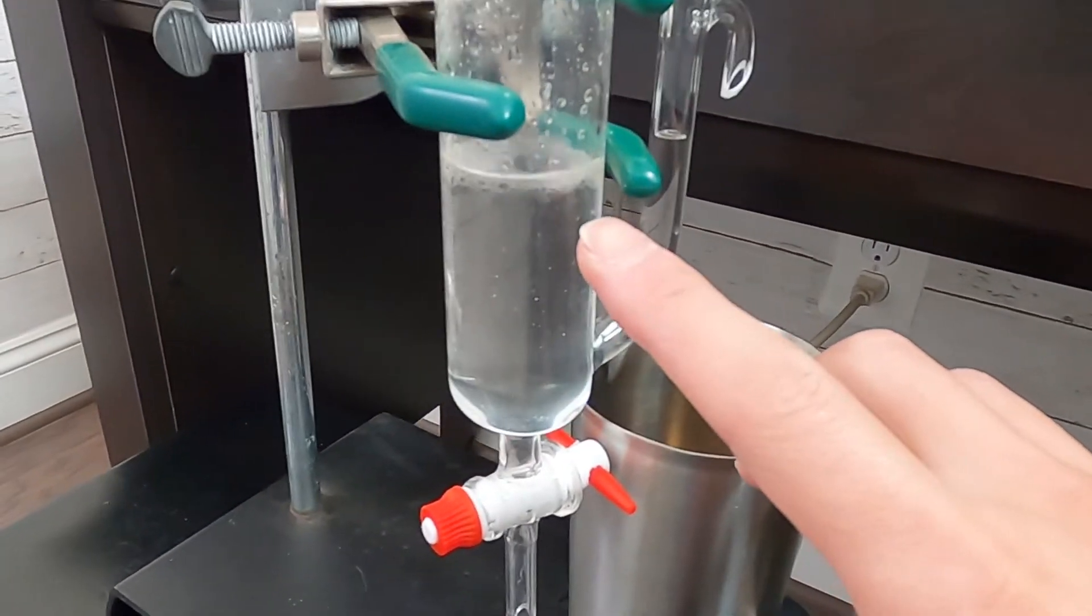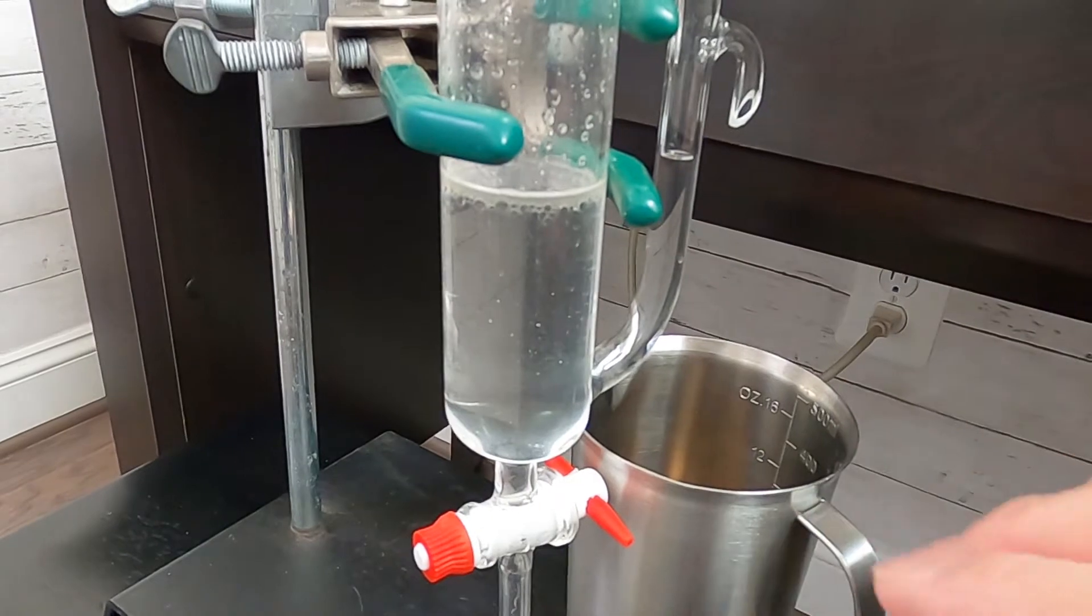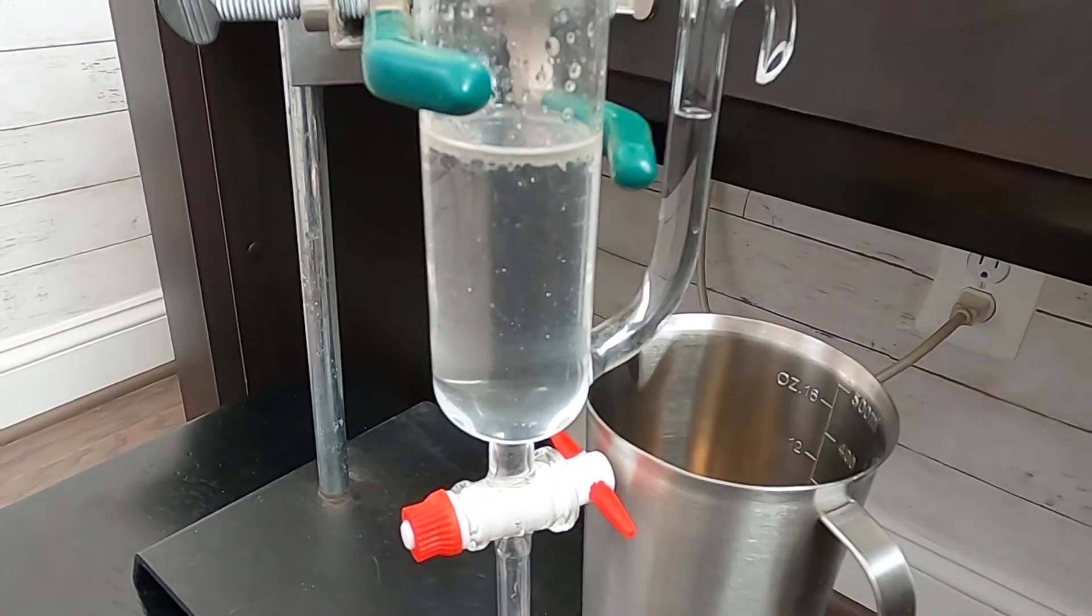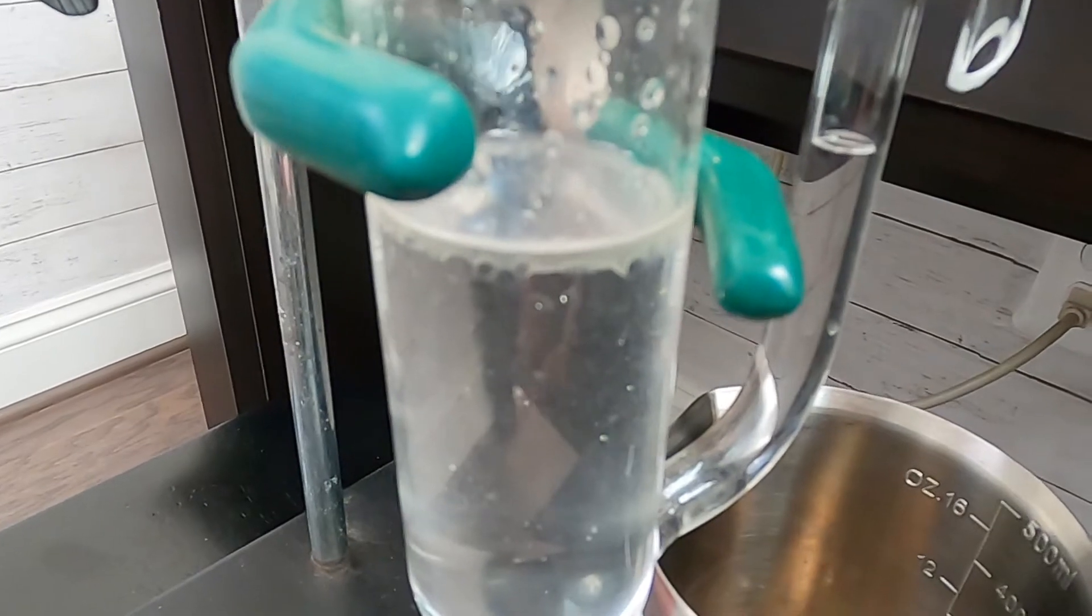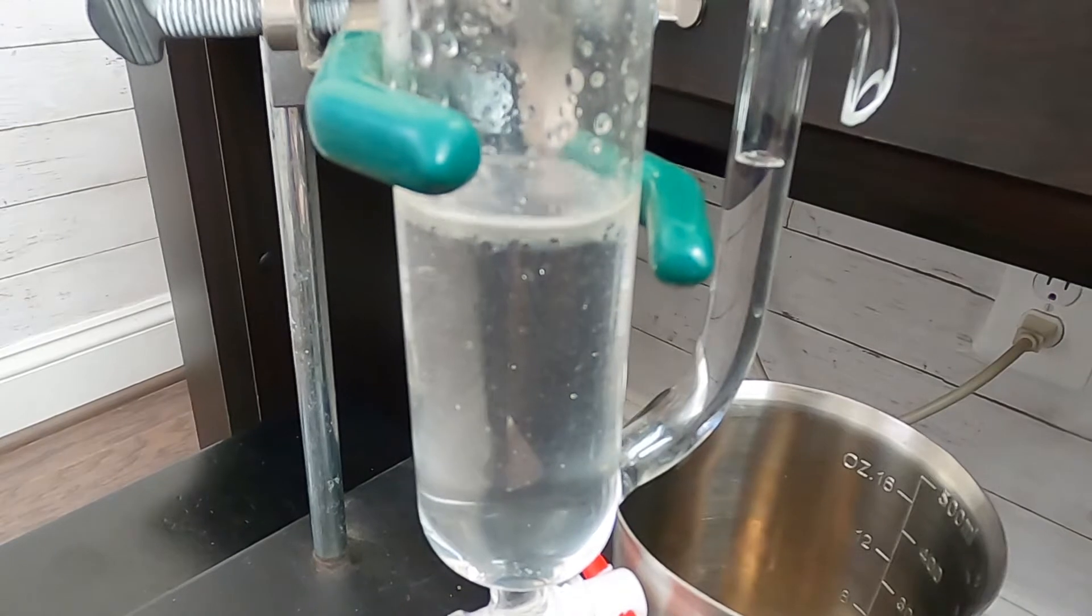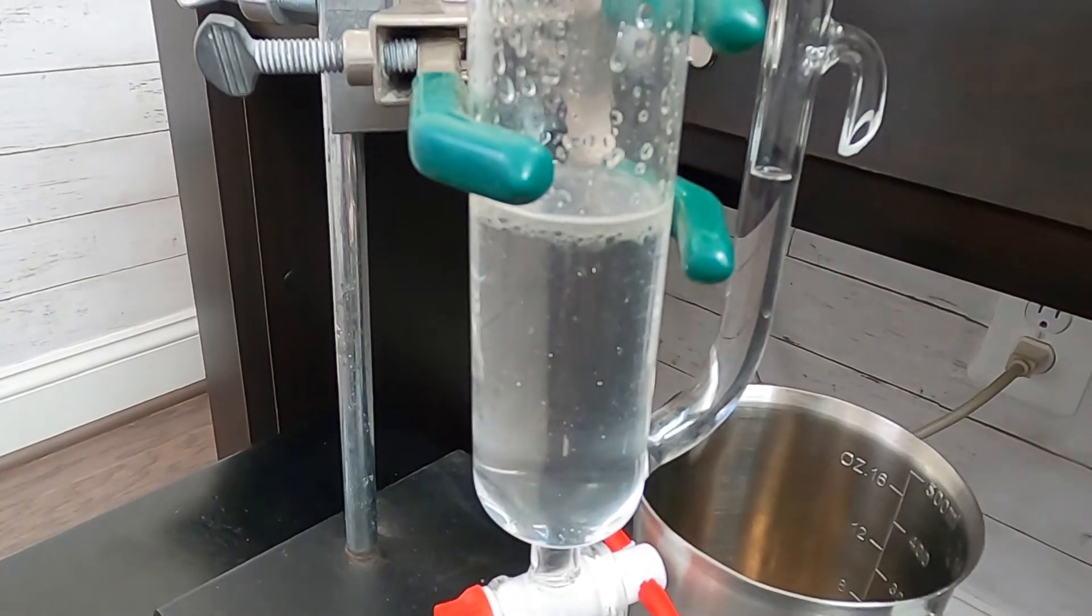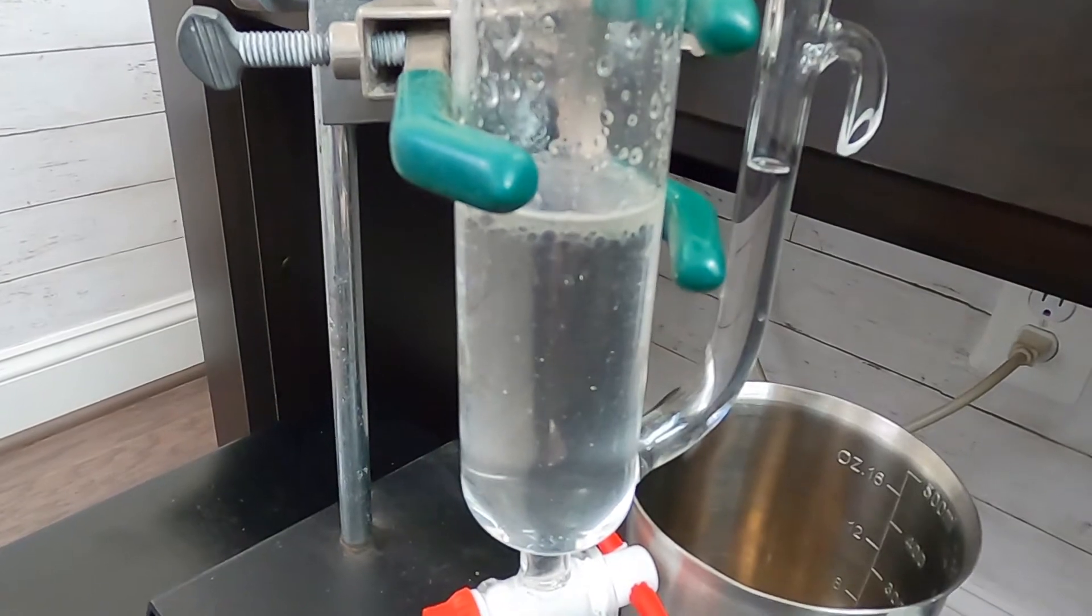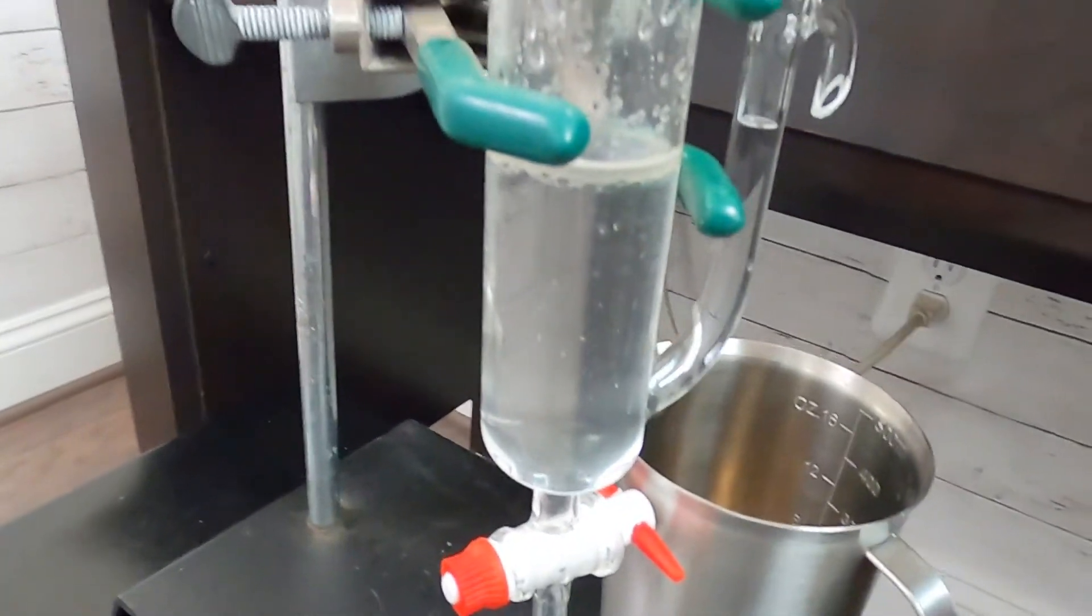So you can see the rosemary oil. It's clear, a little bit kind of white, a little bit like a white color. The different oil has a different color. Like a lavender has a little bit yellow. Ginger has a stronger yellow. Cinnamon has a little bit yellow. And rosemary is like white.